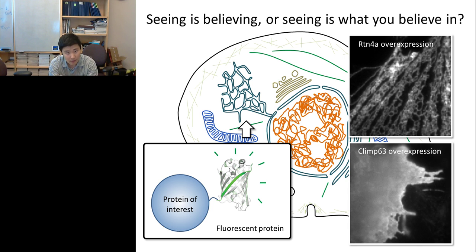And that makes it difficult to understand exactly what's going on with the endogenous ER, with the endogenous morphology of the ER, with the endogenous expression of proteins. This is one task we're trying to go after. This is one method we're trying to establish as an effective way of enabling imaging and analysis of endogenous proteins.